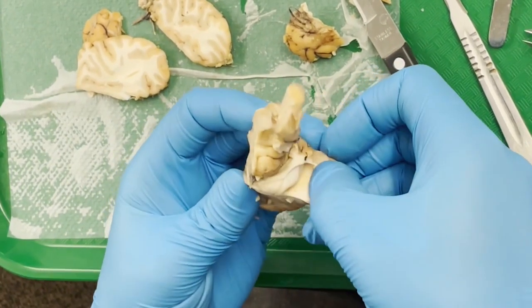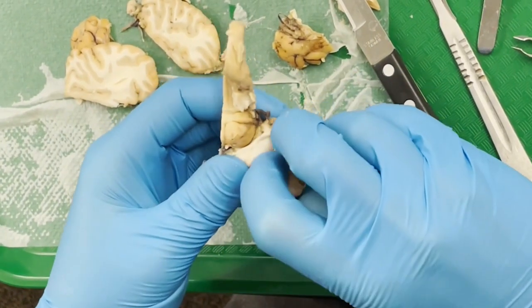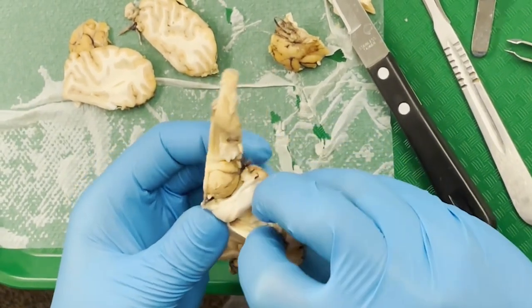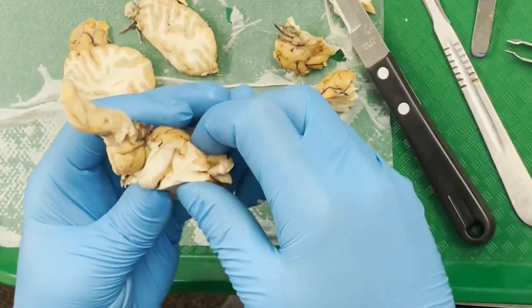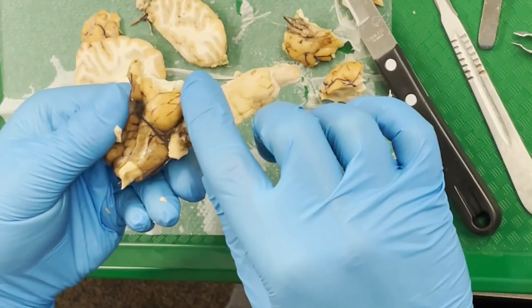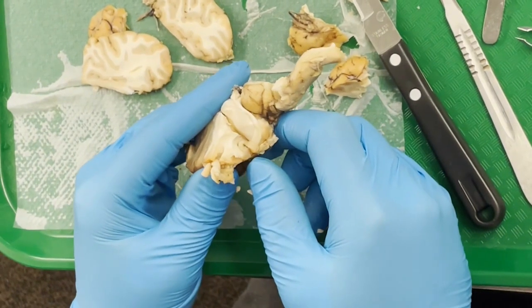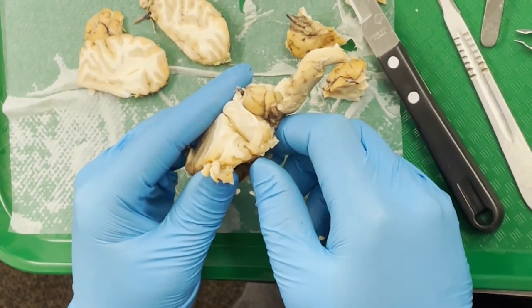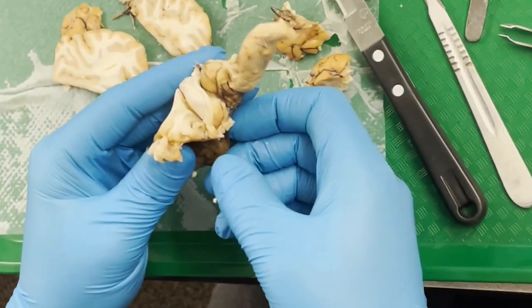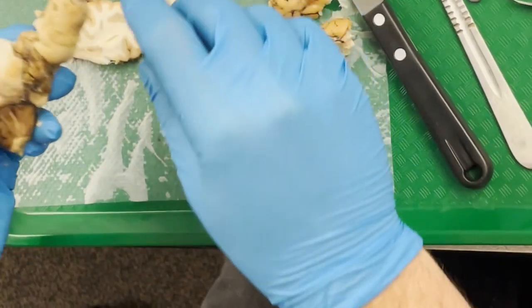I then continue to expose it by peeling off the lateral parts of the cerebral cortex, so I'll just tear off this chunk here to expose it. I'll then tear off the base parts, the piriform cortex I mentioned before. We're now going to try to remove that. It also had the name of parahippocampal cortex. Now we understand the relationship because they're right next door to each other. They connect to each other. So we start peeling this back a little bit more to try to remove it, get it out of the way.